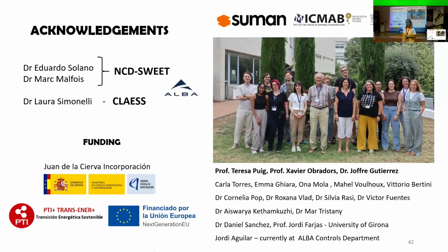However, we have also seen that depending on the orientation of the STO, because we have steps probably, this may affect the GSAXS signal. So this is now very troubling for us, how to do it correctly. Every sample will be oriented differently, and we would have to do AFM first or after to see the orientation of the steps or other features. Maybe it doesn't seem easy. That's why this analysis is ongoing, and we will have to try to extract the signal and back it up by AFM, so we are sure that what we're seeing in GSAXS is the real thing.